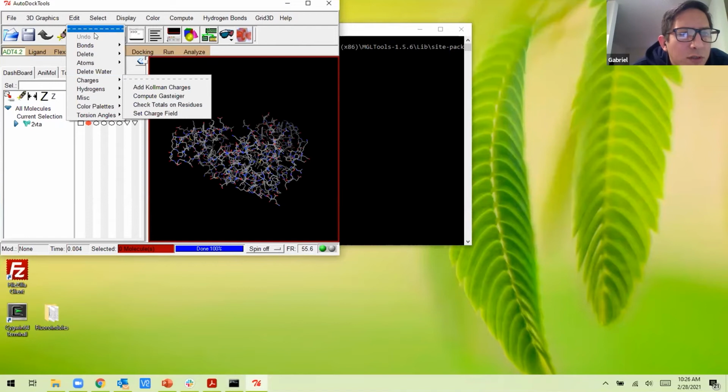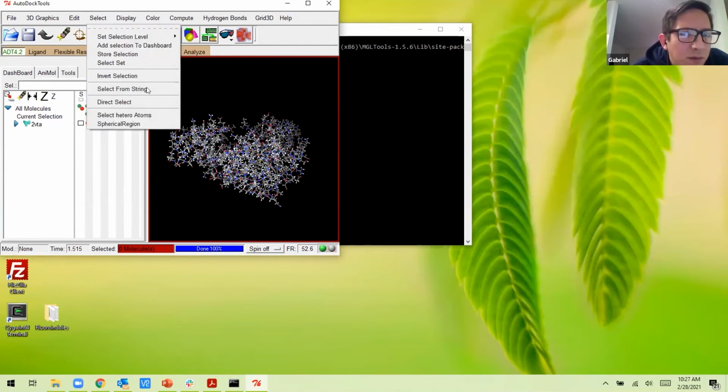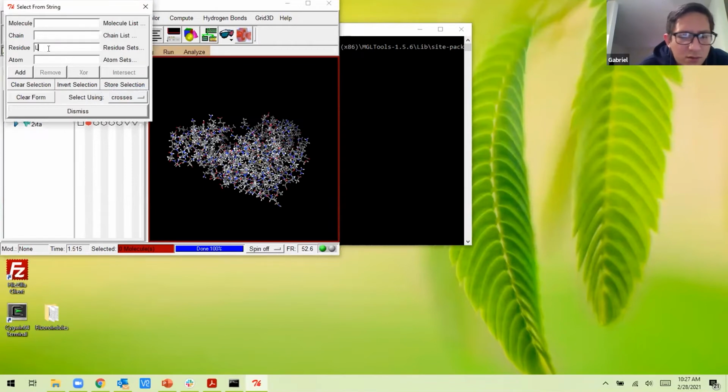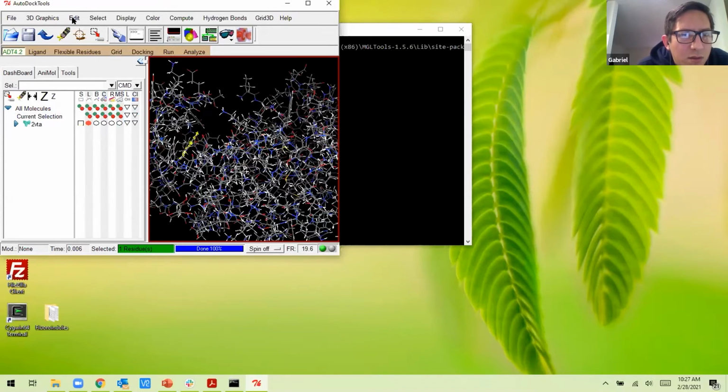What else? Hydrogens. Okay. And then select from string. Delete.